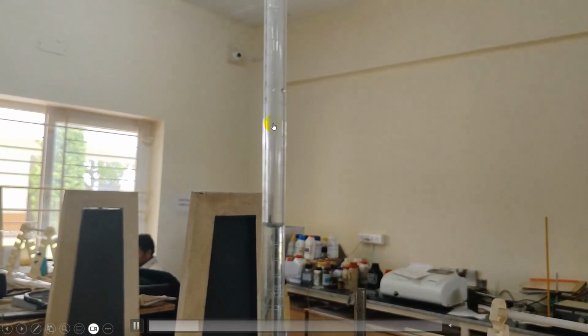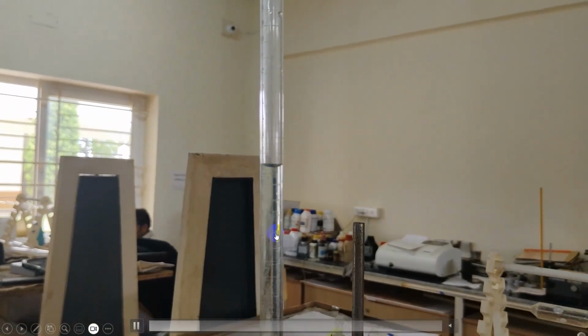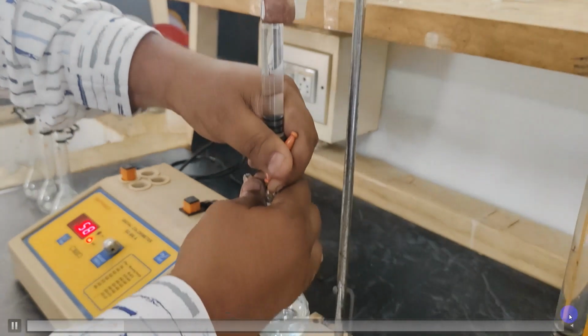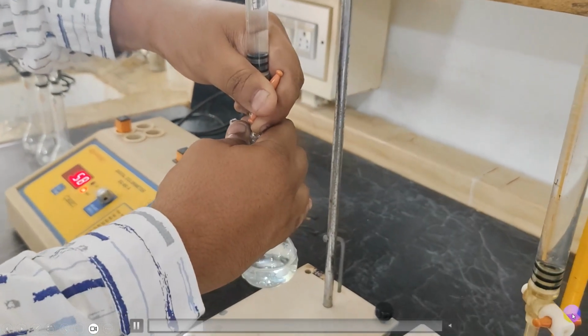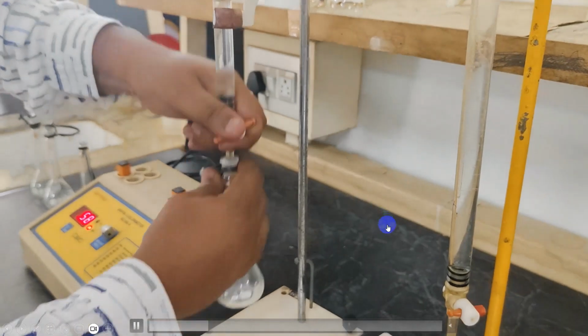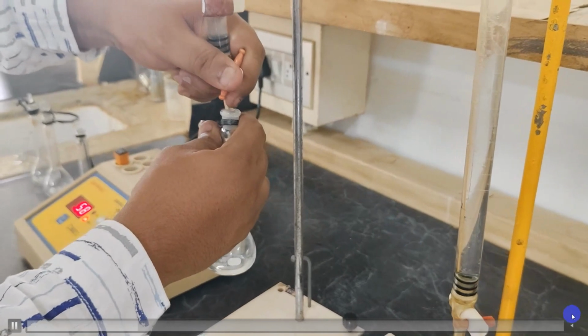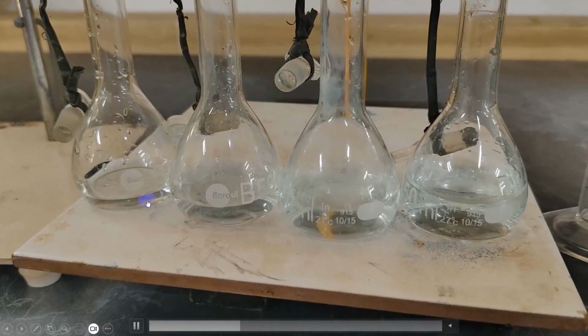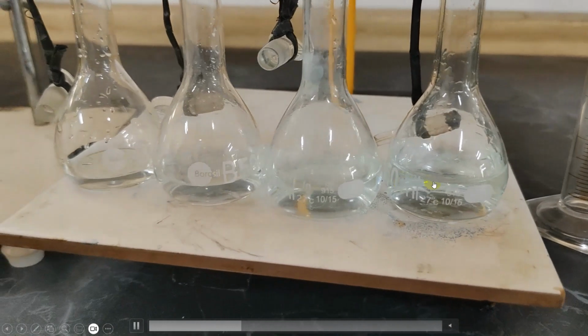Here we are going in the reverse order. First 20 ml will be filled, later on 15, 10, 5 will be filled. In the similar way, fill the remaining standard flasks. So you can see the change in the volume, 5, 10, 15 and 20 cm cube of copper sulfate filled.